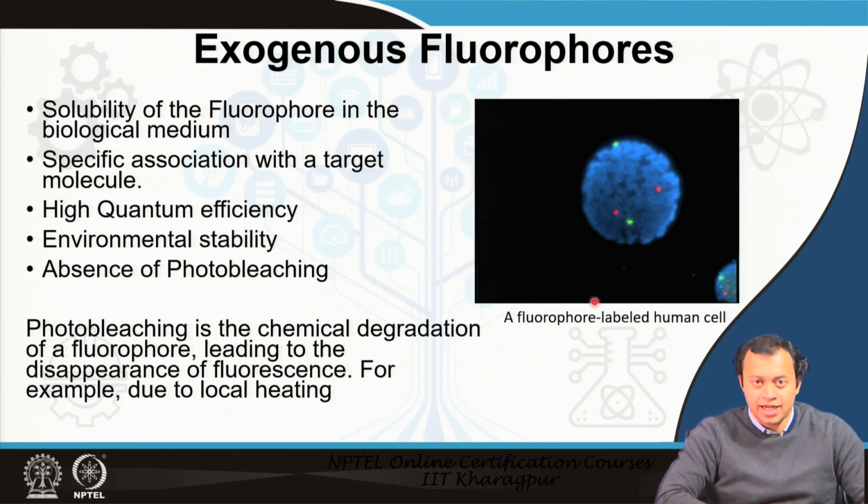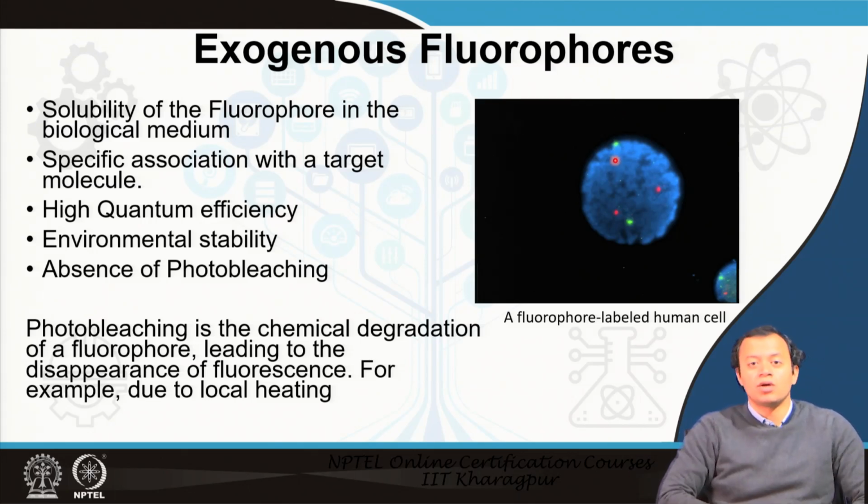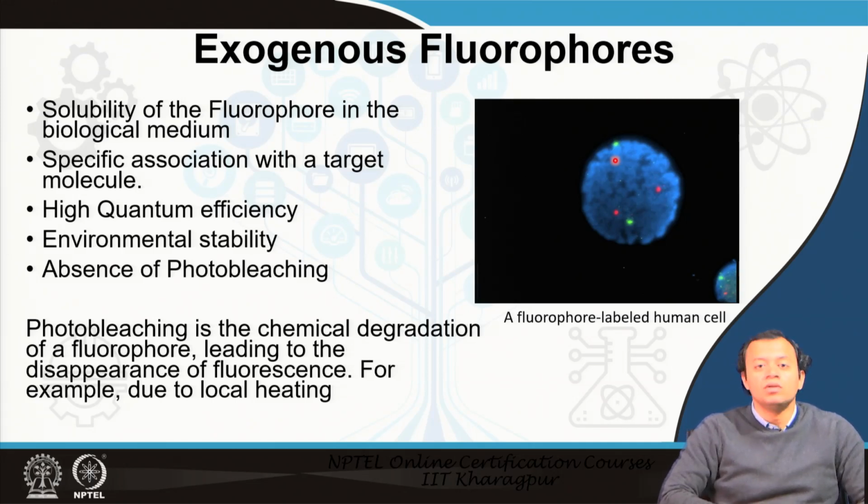They are not randomly attached. So wherever this emission is coming out, you can understand that there is a chromosome, and thereby you focus your microscope onto it, confocal microscopy, laser scanning microscopy, whatsoever, and life is good. You are able to image it beautifully.